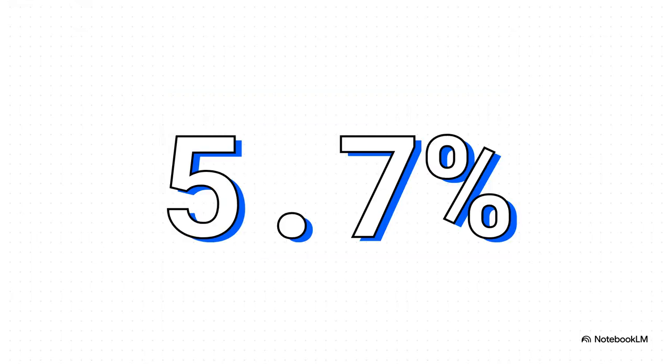In fact, the average error across all of their tests was just 5.7%. Now, for a brand new technique that uses nothing more than a simple microscope and a digital camera, that level of accuracy is just fantastic. It proved the method wasn't just clever in theory, it was totally reliable in practice.